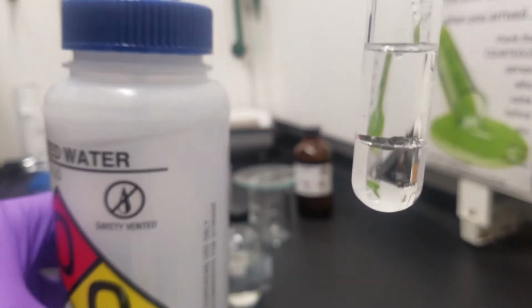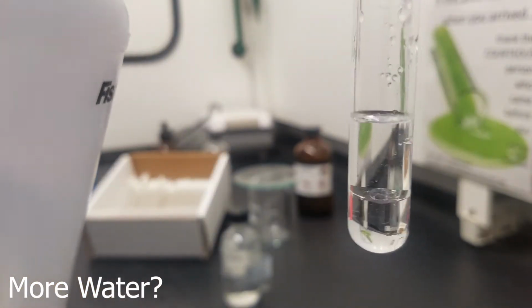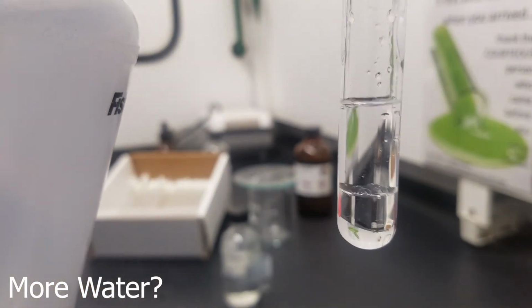That mixture was a little bit weird and different this time than the last one. So here what we're doing is adding a little bit more water. Let's see what the water helps us to see. That meant the top layer was the aqueous and the bottom layer was the organic.